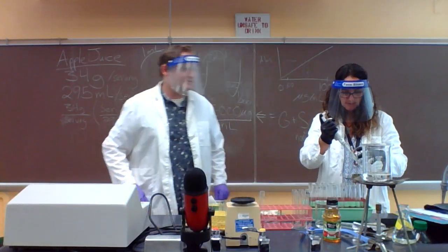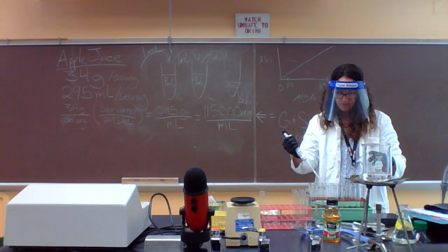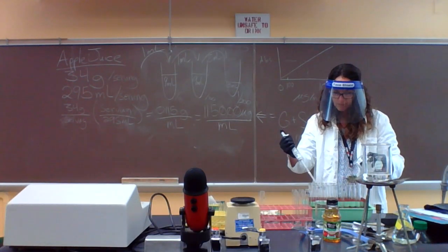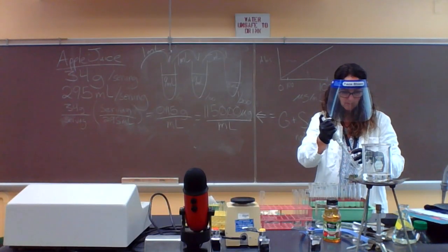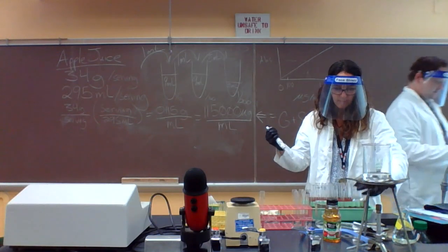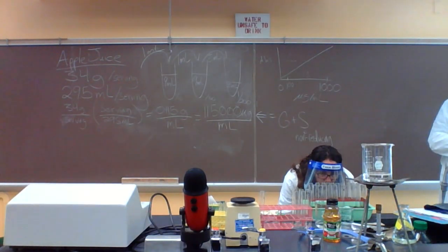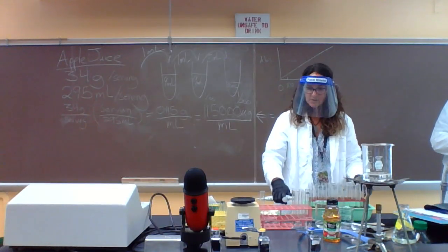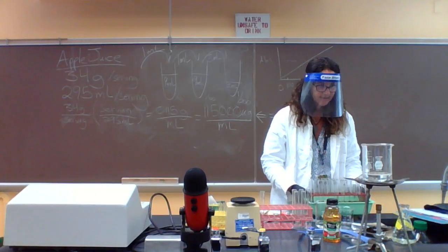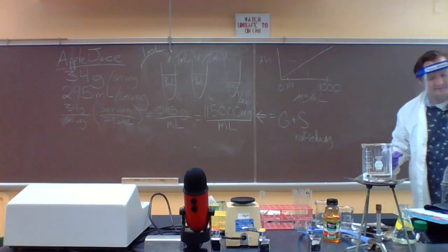I am going to use a micropipette. Okay, so these are good to go. I'm going to set them aside. Perfect. So we're ready for them.